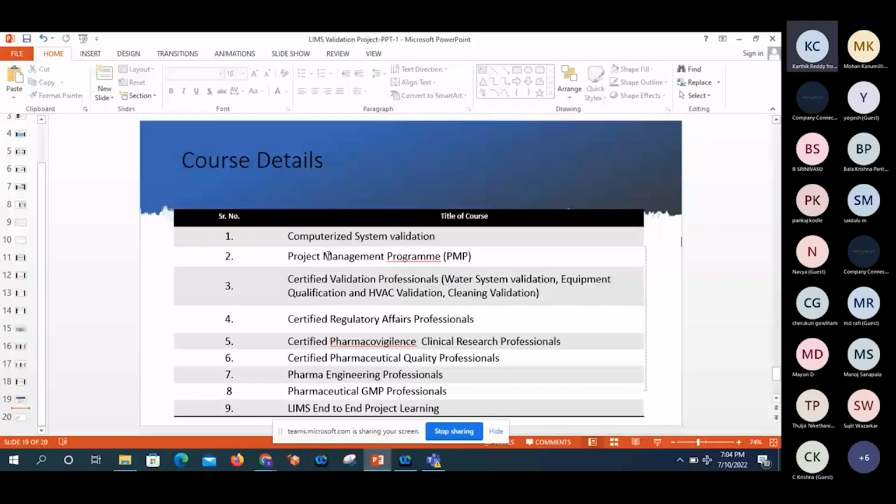What is the content? See, I will explain the flow of how to create Crystal Reports by using the managed tables from the system, and how to tag a query to each table. Without the software, I can't explain that thing. Sorry for that.